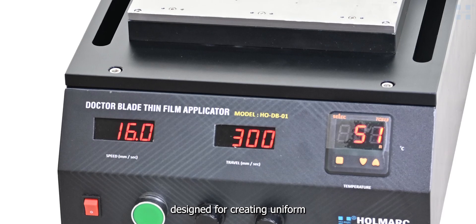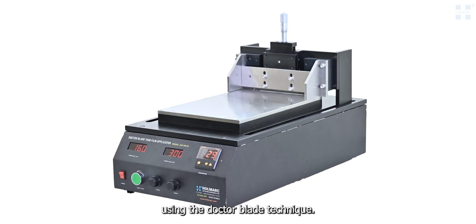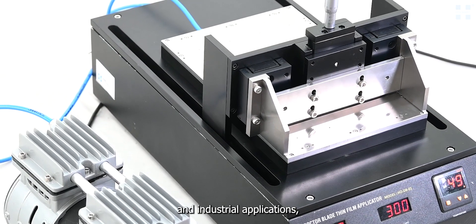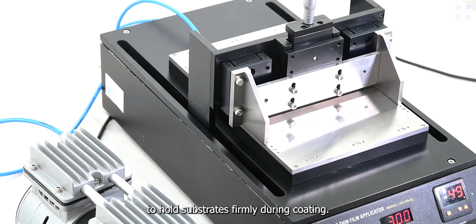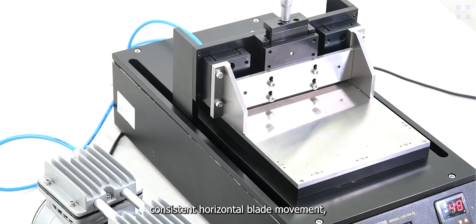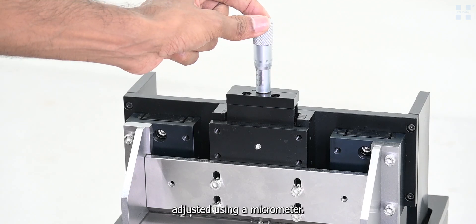HOLLMARK'S DOCTOR BLADE THIN FILM APPLICATOR, Model HODB01, is a precision instrument designed for creating uniform thin films on flat substrates using the doctor blade technique. Ideal for laboratory and industrial applications, it features a stainless steel hot plate with vacuum suction to hold substrates firmly during coating. A motorized translation stage ensures consistent horizontal blade movement, while film thickness is easily adjusted using a micrometer.